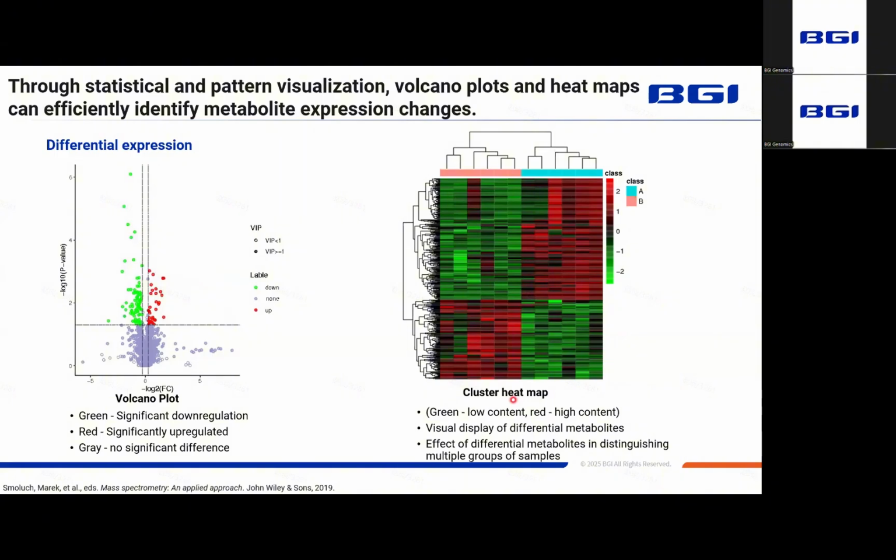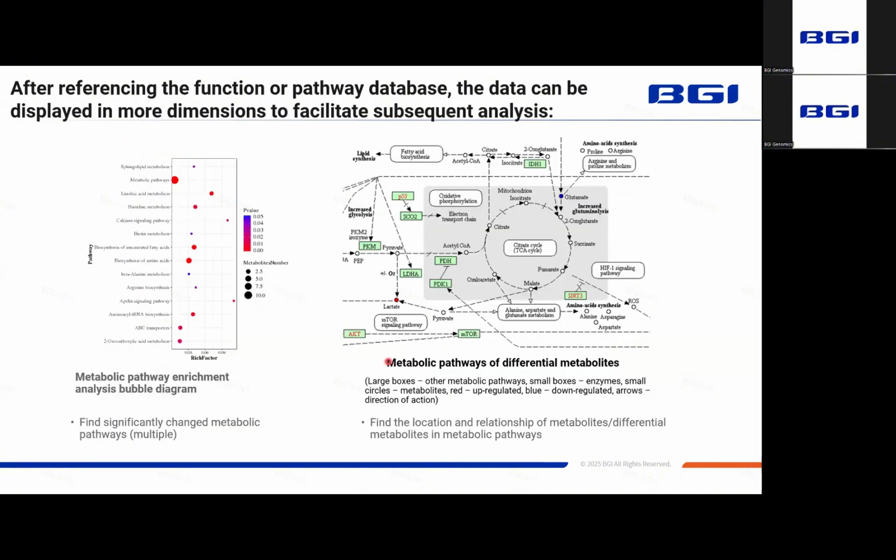This method effectively reveals similarity and differences across multiple variables, such as the relative abundance or intensity of features in MS data, making it a useful tool for highlighting upregulated or downregulated patterns across samples. Mainly with these two sets of maps, we can distinguish those differences between groups.